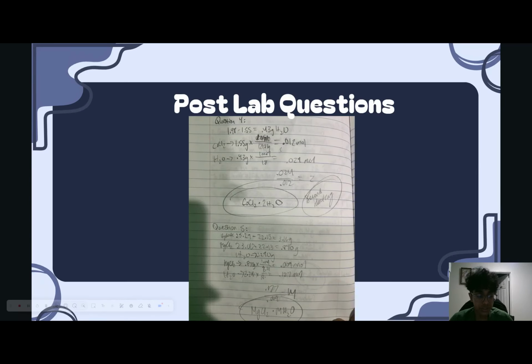Then for question 4, it was the same kind of idea, but that was for CoCl2. I did the same dimensional analysis and found the missing ingredient, and for CoCl2 it was 0.012 moles, and for H2O it was 0.024 moles, which got the same coefficient as the last problem, which was 2. So the chemical formula was CoCl2 times 2H2O, and then a second heating would help bring CoCl2 to a final mass that was consistent and more accurate.